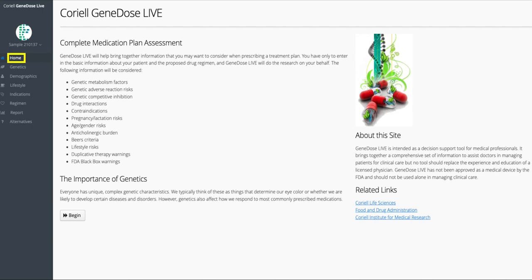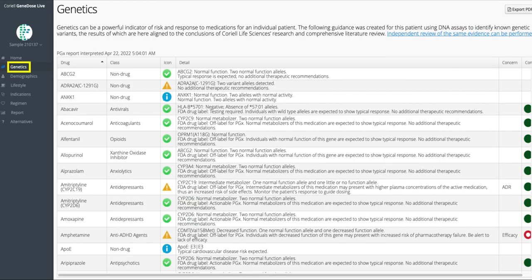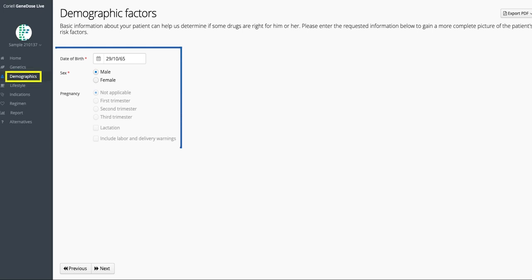This is now the live portal where all the patient's genes and drugs with genetic influences are listed. No need to go through all of them as they are all linked to the unique sample ID. The genes and the drugs may take about 30 seconds to populate. The black panel on the side should flicker to indicate this is going on. The patient demographics will be automatically populated.